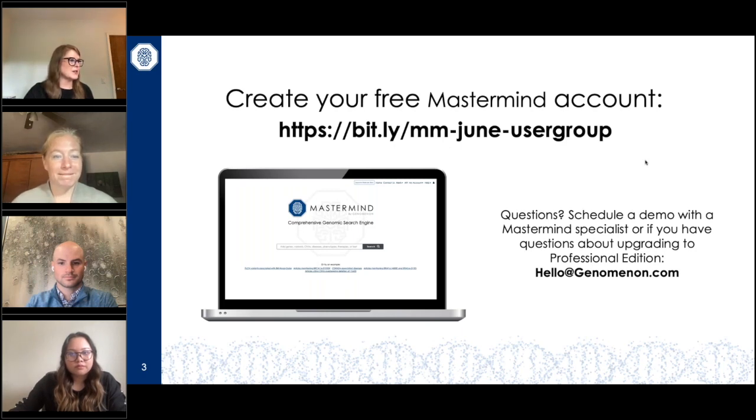Okay, here is a question about whether we can use wild characters to search for a related variant, like c.1234?A>G. We might not know the answer to that one, but we'll have to follow up, I think. Well, it's the same idea as what I'd said before. You can search one variant and then use the table to look at any other variant.